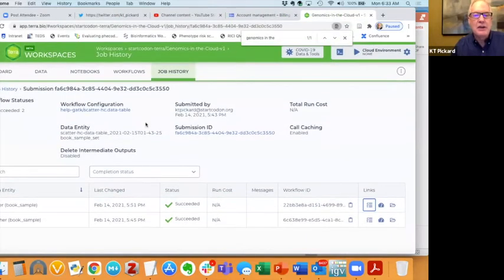Okay, well that gets us through the first haplotype caller and using that. Let's see, we'll go into cloning now. We'll work on the next, the full germline caller. But before I go there, I just wanted to talk a little bit more about cloning. There's a note in the book about how cloning works.